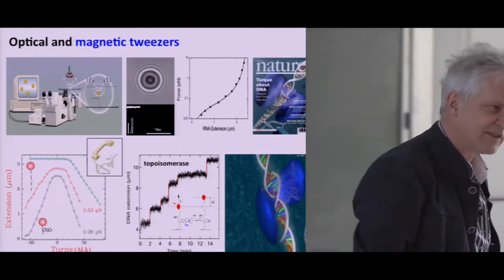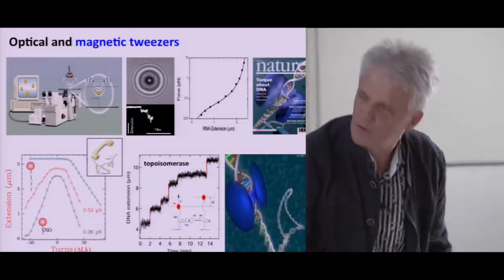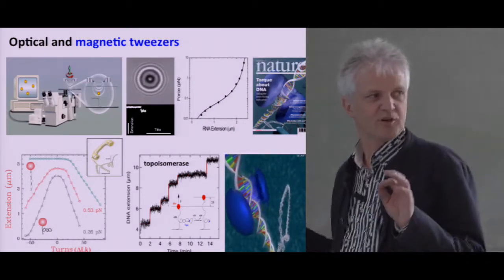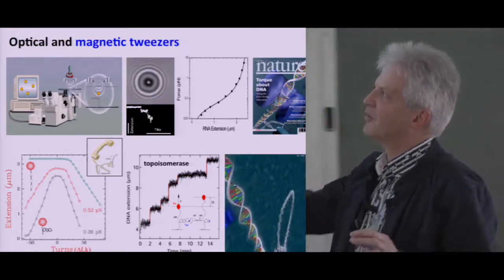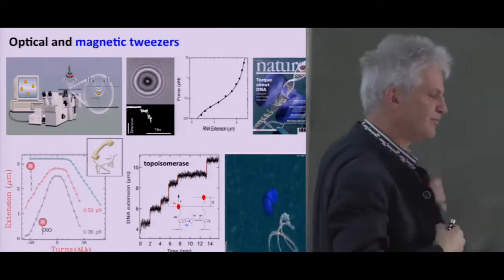And so what you measure there is the action of a single protein on a single DNA molecule, which is the point that I was trying to make at this point in the introduction, right? So you see every step here is the action due to a single protein.